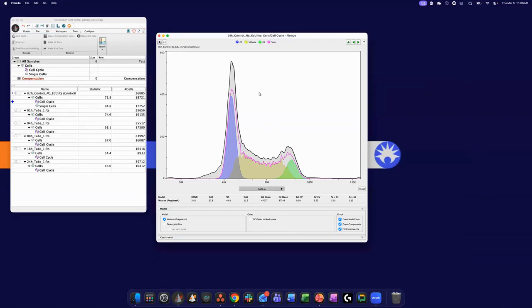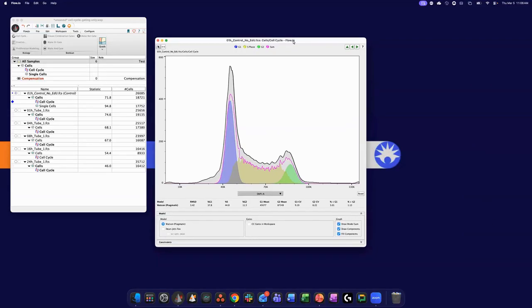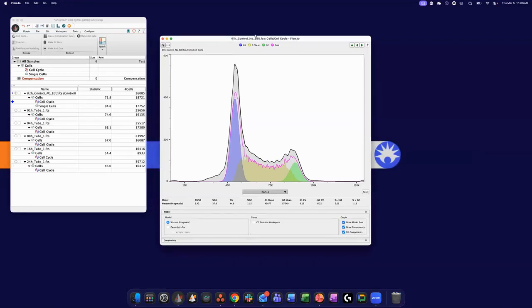Great, you're welcome. Okay, so we're running short on time, so I'm going to go ahead and move on to the 2D and 3D cell models here, just so we can start to wrap up. So, just to show you, this is the cell cycle model in a nutshell.